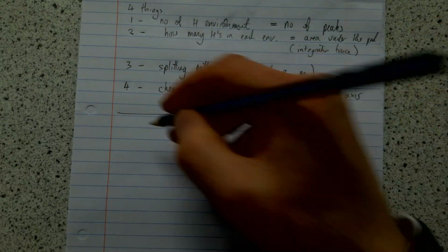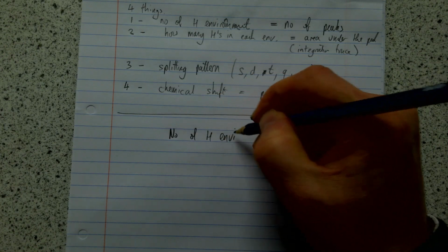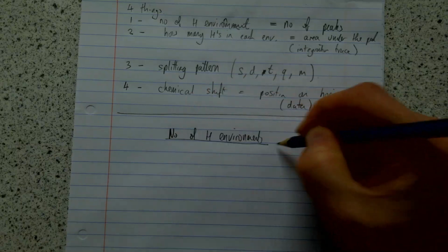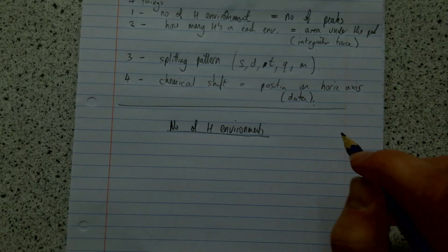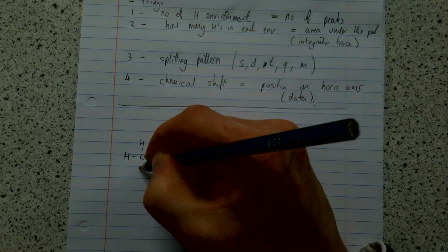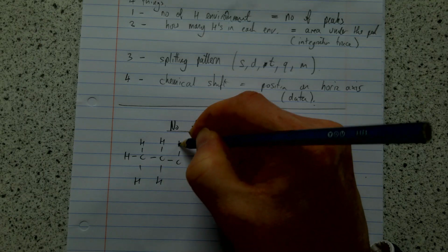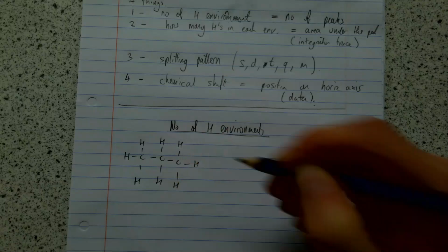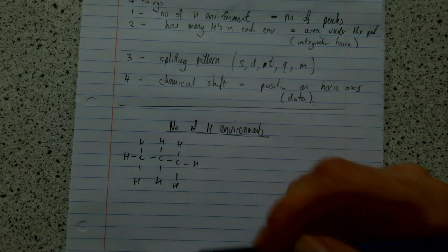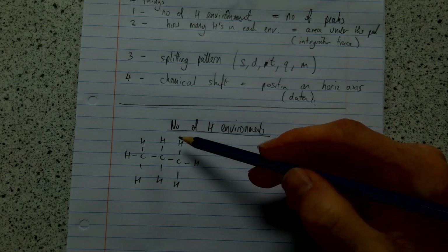Right, so we're going to start off with the first skill, which is the number of hydrogen environments. We spent quite a long time on this in class, but I'm going to do it quite quickly now. What I'll do is I'll draw some molecules, and we'll just see if we can work out how many different hydrogen types there are. The thing we're looking for is hydrogens that count as one hydrogen environment: the hydrogens in an environment are completely identical. In other words, the view from that hydrogen is the same as other ones, if you like.